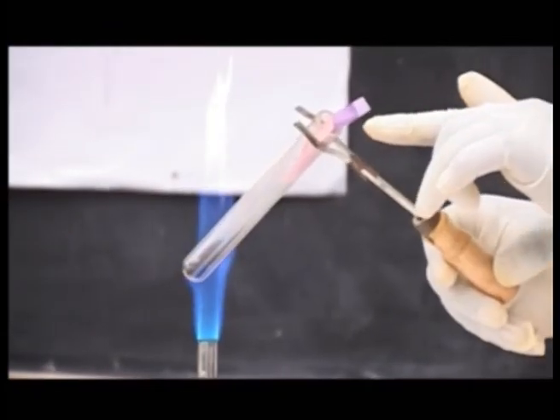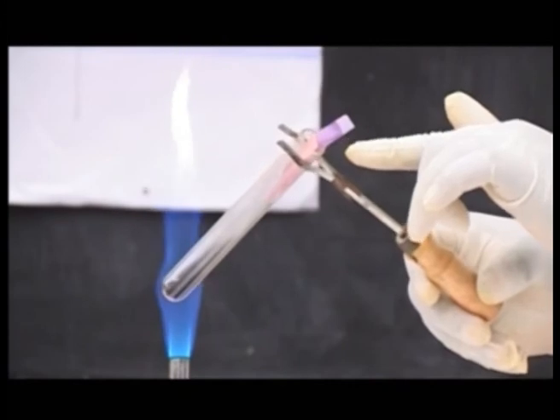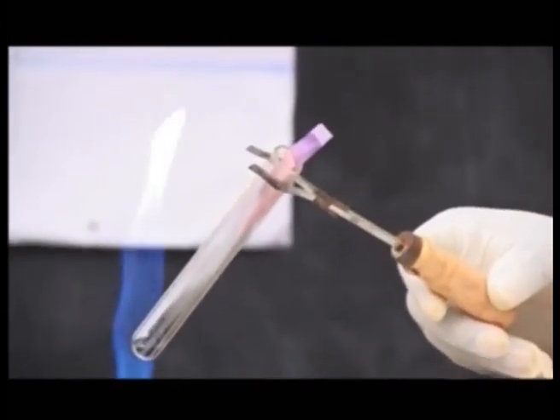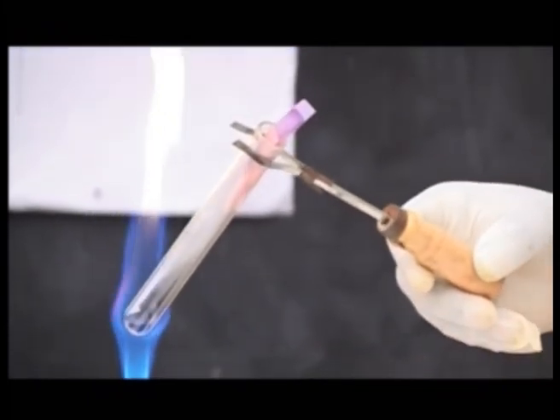The color of blue litmus is slowly changing into red, and the color of residue is black.